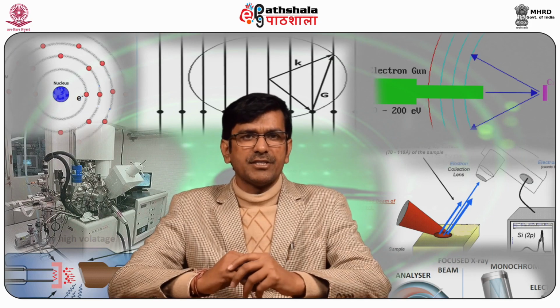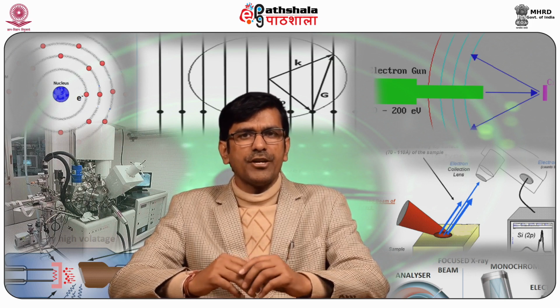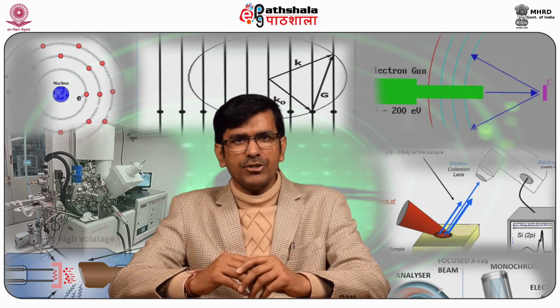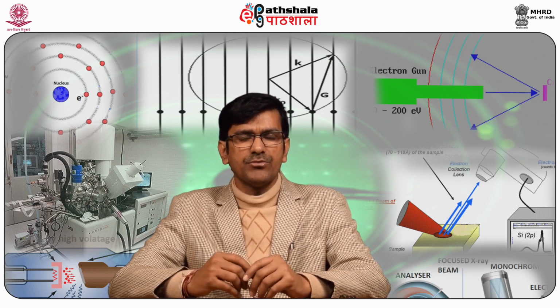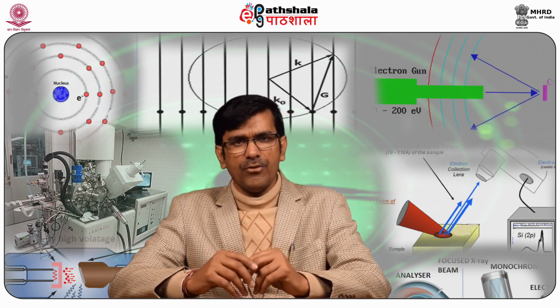Next is the data analysis. Most electron spectrometers use online computers for operating and data collection. It is also desirable to correct the data for background, distortion of collection efficiency as a function of electron energy, and contributions from satellite X-rays if a monochromator is not employed.